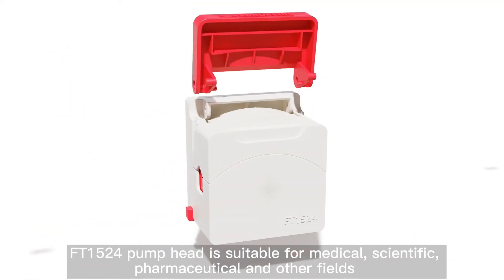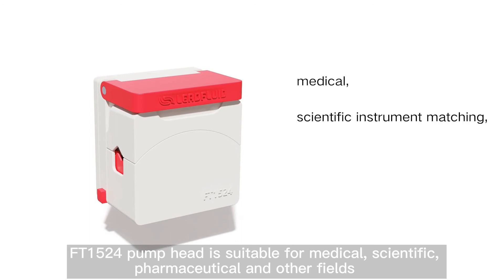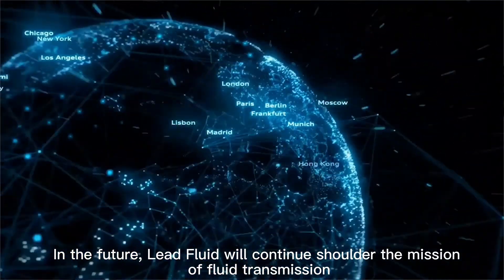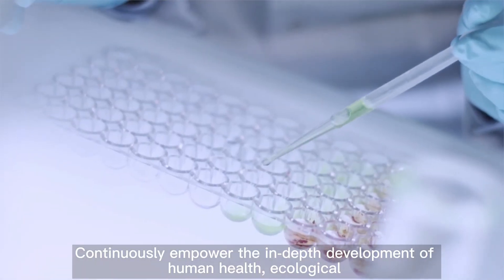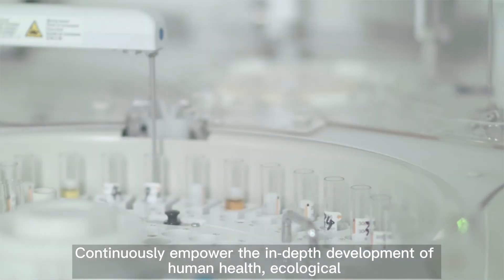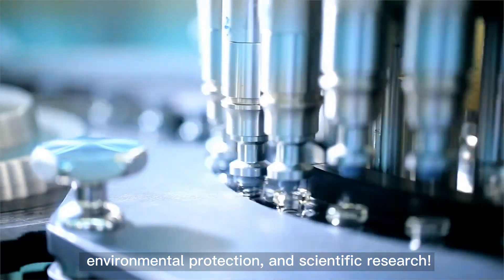FT1524 pump head is suitable for medical, scientific, pharmaceutical, and other fields. In the future, Leedfluid will continue to shoulder the mission of fluid transmission, continuously empowering the in-depth development of human health, ecological environmental protection, and scientific research.